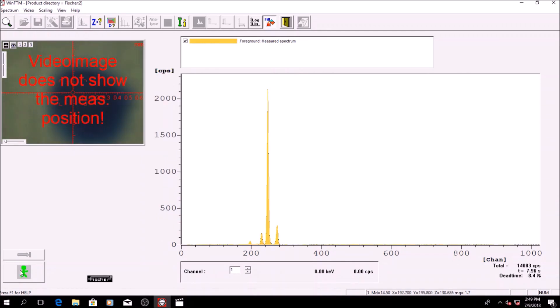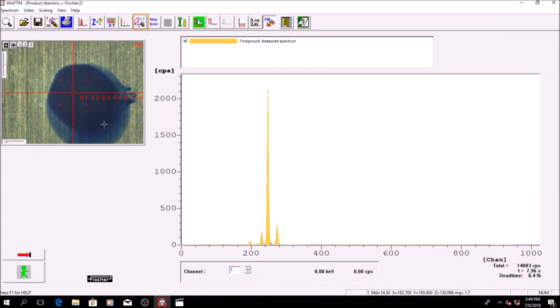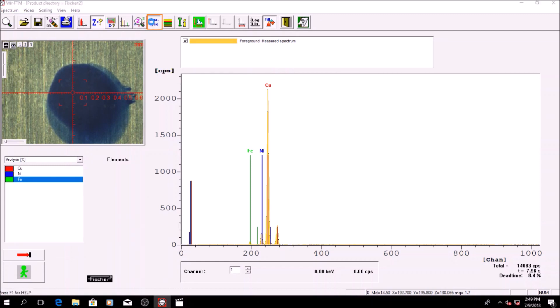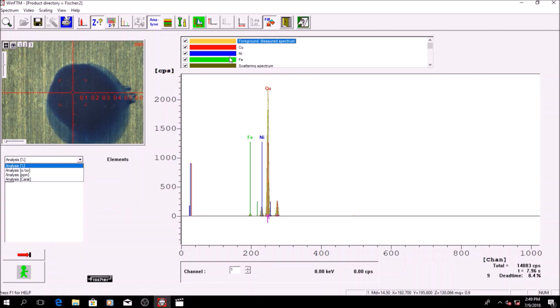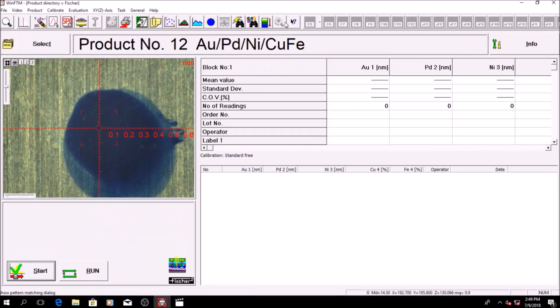Click on automatic search for elements followed by analyze. And you can find out the percentage, ppm, or carat of elements present in the sample.